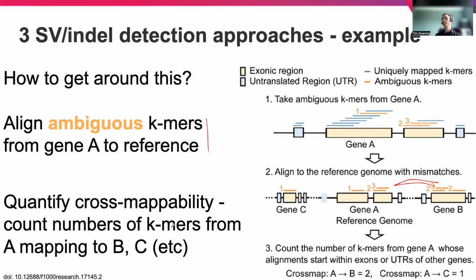So looking at structural variants is really about trying to accurately assign reads to regions and resolve what information might be present, given the type of reference that is available. And the reference may be limiting or incorrect and may differ. So this is a nuanced area, as you can see.